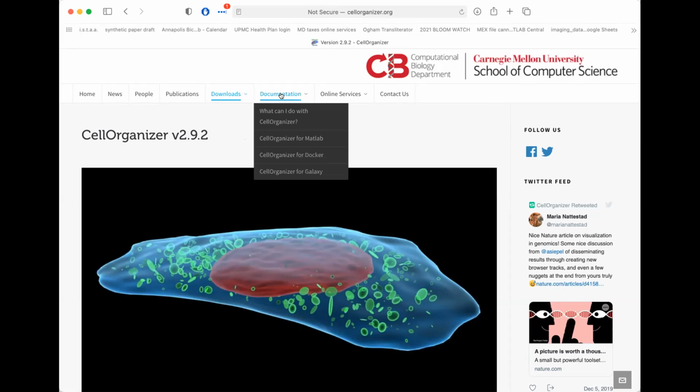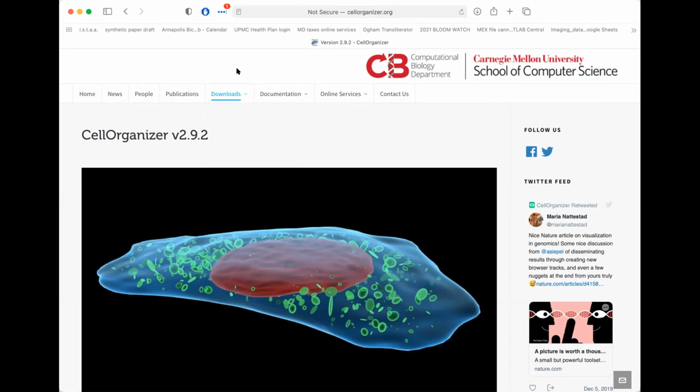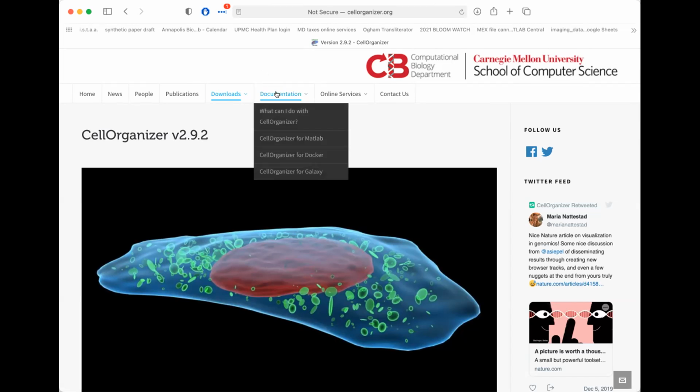One more question. There is a paper that was just recently published on bioRxiv from the Allen Institute that uses the spherical harmonic for the 3D shape. Yes, so this is the actual code for the paper, I think. I think this is the method. They may have another implementation, but I think they're using the same code. Okay. Cool. Thank you so much.